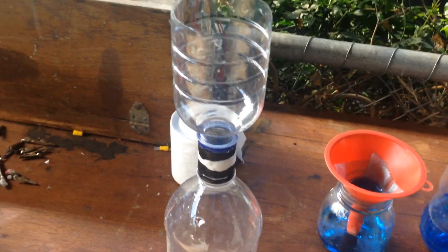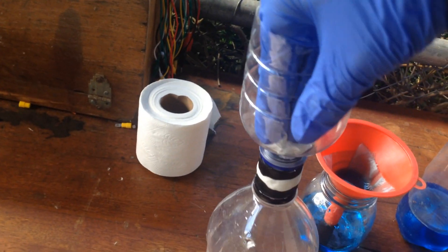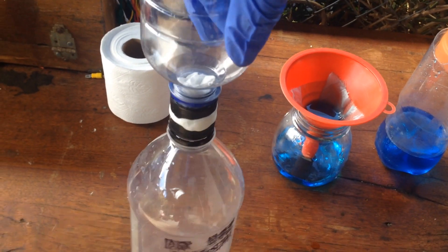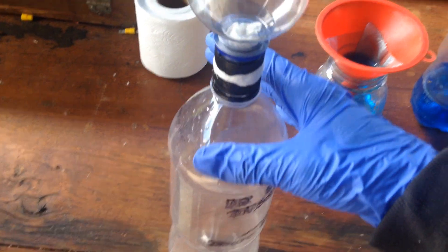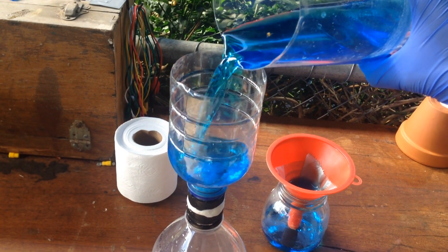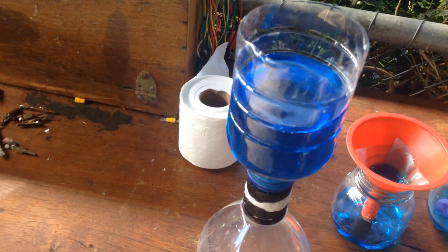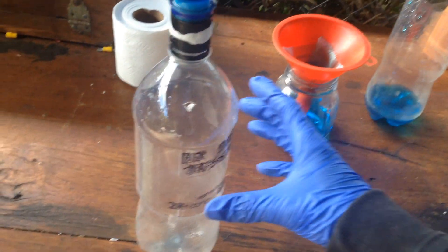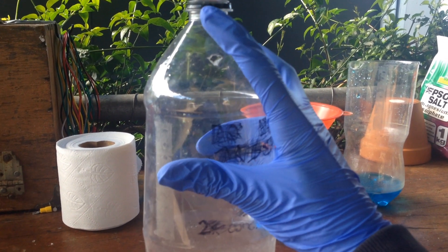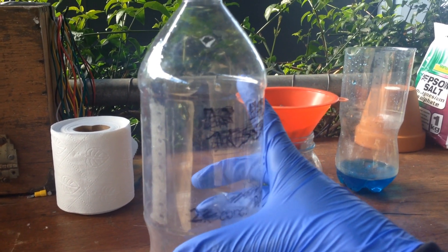So what we'll do to set this up is we'll put some toilet paper or something to act as our filter, and we'll just compress that into the bottom here. That'll act as our filter to filter out all of the solids that are in our solution. And then what we can do is we'll pour this in. Now to suck the solution through, we squeeze the bottle and then cover this hole with your finger, and what it should do is suck the solution through.